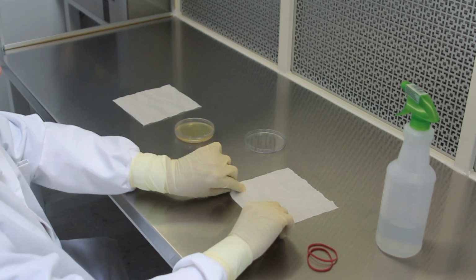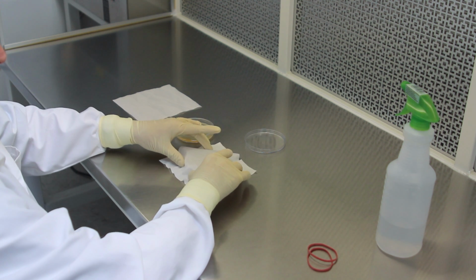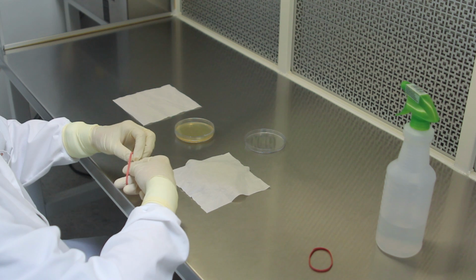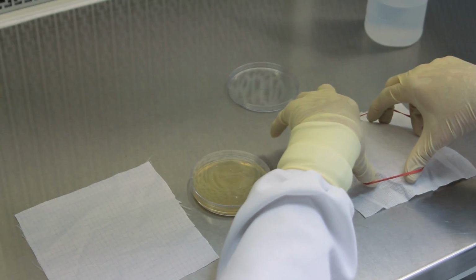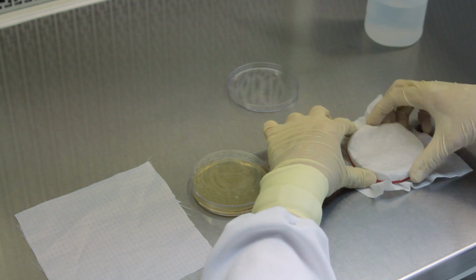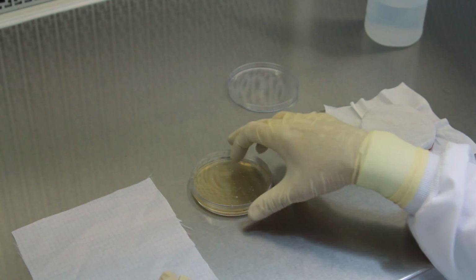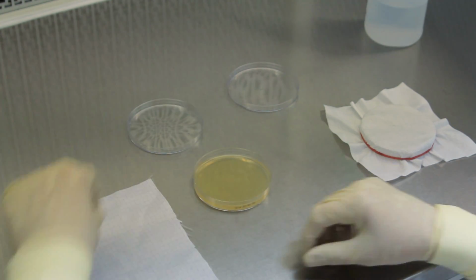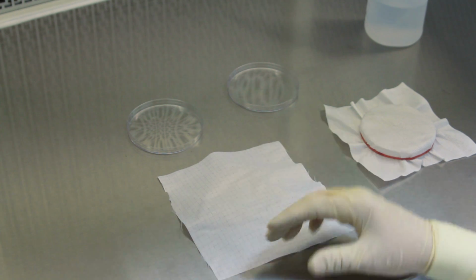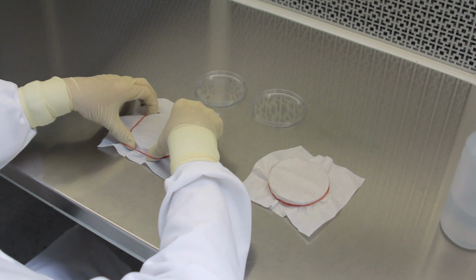This is the reenactment of the test performed by a manufacturer of disposable cleanroom garments and posted on their website. It is Prudential's contention that, if the test was performed as shown, both the disposable and reusable garment fabrics would have very high BFEs. In a horizontal laminar flow hood, the lab technician places a piece of fabric over the top of a petri dish containing nutrient agar. He then fastens the fabric to the petri dish using a rubber band.